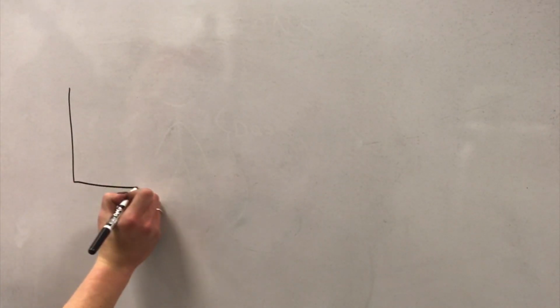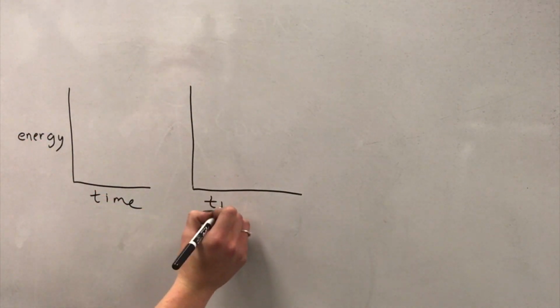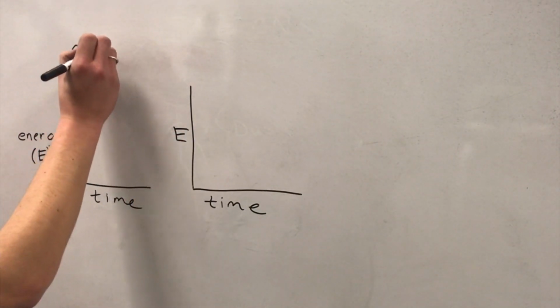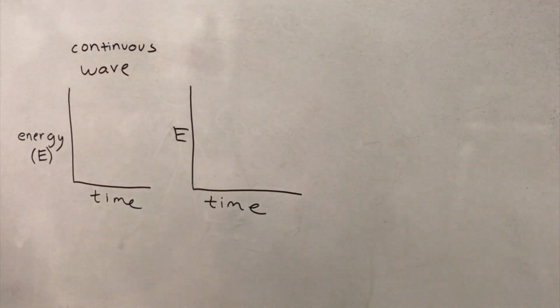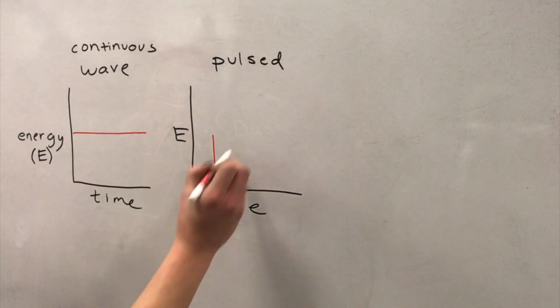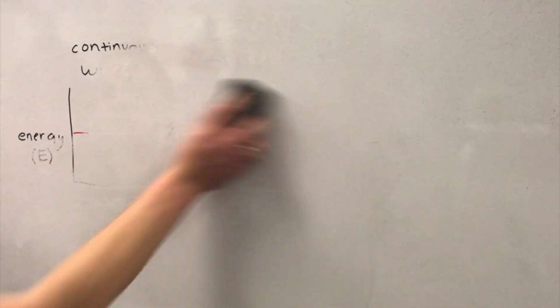Since two-photon excitation depends on simultaneous absorption, the fluorescence emission varies with the square of the excitation intensity. This means TPM requires a higher intensity and a more powerful laser than confocal microscopy. A pulsed output laser is used instead of a continuous wave laser to achieve the necessary peak power without exposing the sample to a damaging high intensity for long periods of time.